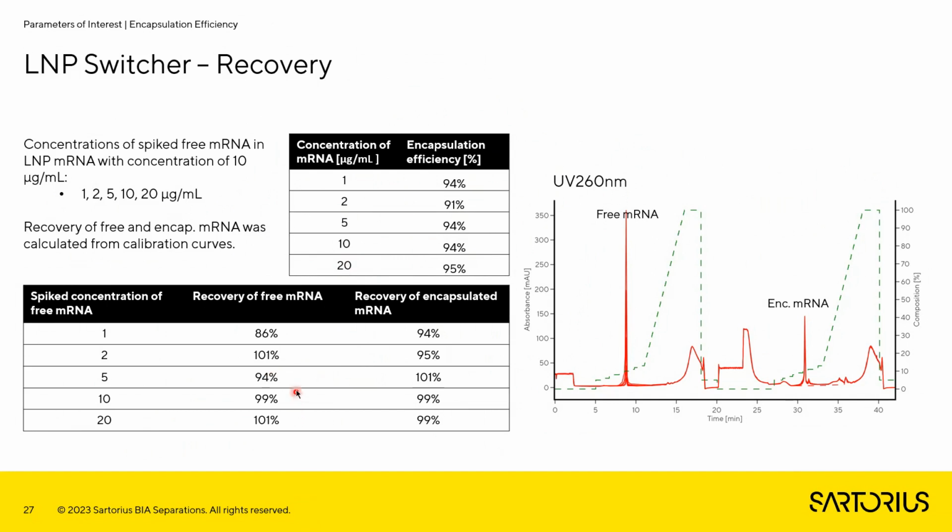And we also checked the recovery of free mRNA and recovery of encapsulated mRNA by spiking these two species into the null concentration of LNP particles. And we can see that we obtain quite good results for the recovery of the individual nucleic acid species.